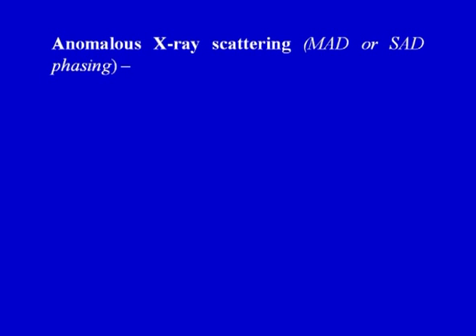There could be anomalous X-ray scattering. This is another method. Here the X-ray wavelength may be scanned past an absorption edge of an atom, which changes the scattering in a known way, and by recording the full sets of reflections at 3 different wavelengths, one can solve for the structure of the anomalously diffracting atoms and hence the structure of the whole molecule.